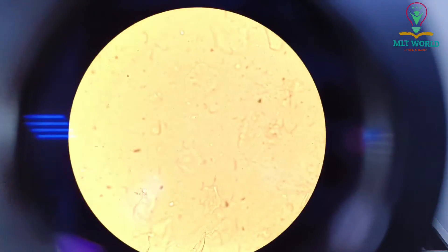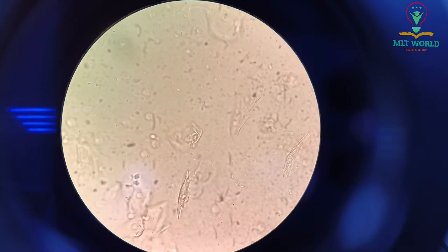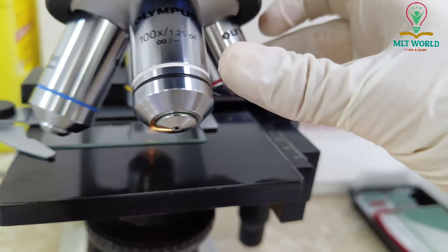For blood smears we change directly to the oil immersion lens at 100x, but for urine and stool smears we use the 40x lens. Now I have switched to 40x and I will show you the field after changing.